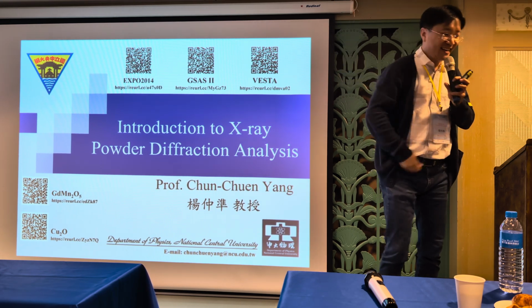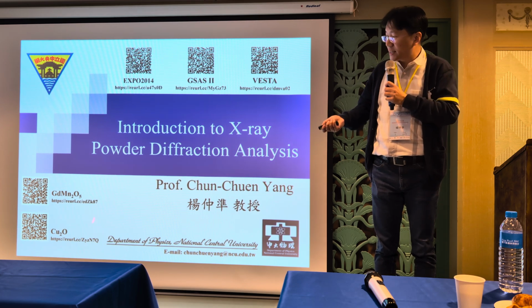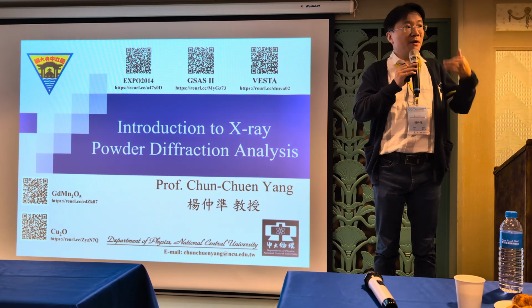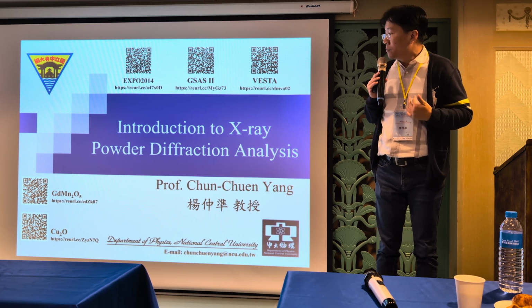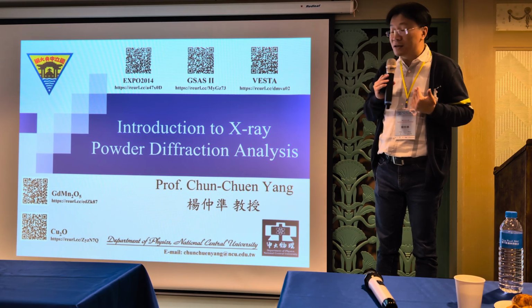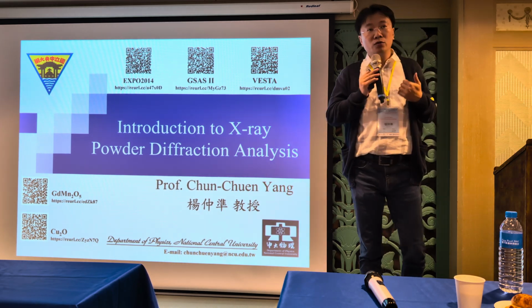Okay, today my course will cover these three software programs, as well as my example data files. Of course, before doing structure refinement, I need to tell you some basics about how to collect the data. So before we start to refine our own data, there are several things we need to mention about how to do this kind of experiment. If you do not do the experiment correctly, you will not get a good refinement.